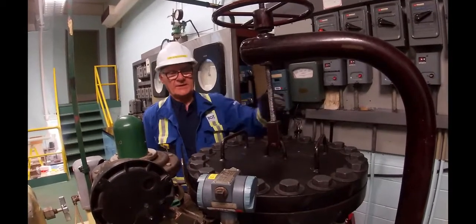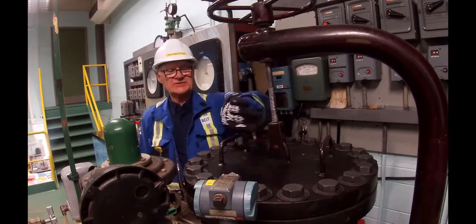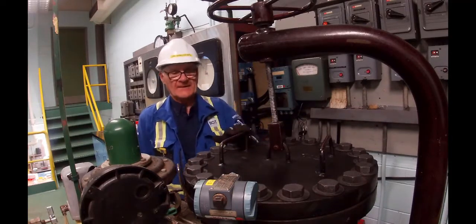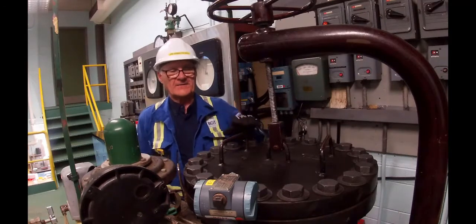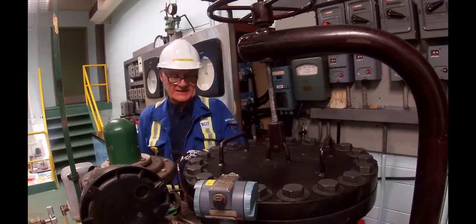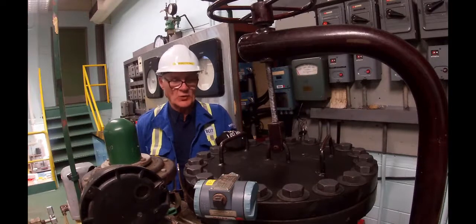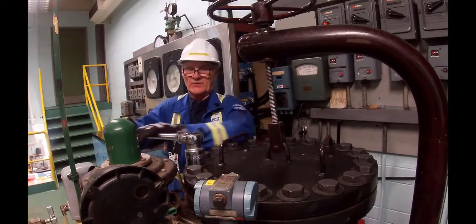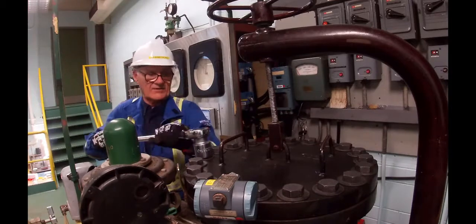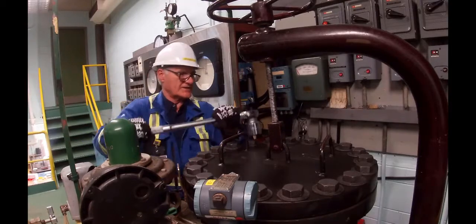So we used the torque wrench and we crisscrossed and tried to get it nice and uniformly pushed down. There's a rib sitting just on the underside of the lid, which actually pushes into the gasket, which is sitting in a recess around the top. Just before we put the lid down, I ran my finger around there to make absolutely certain that there were no bits of wood or chips stuck in there, because then you'll start getting vapors leaking out through here, and it's nasty stuff. Black liquor is not to be toyed with. Anyway, I'm going to give these guys an extra crank with a hand wrench. You don't have to crisscross on this, they're already down. Just a matter of making sure that it's good and tight so we don't get any leaks.